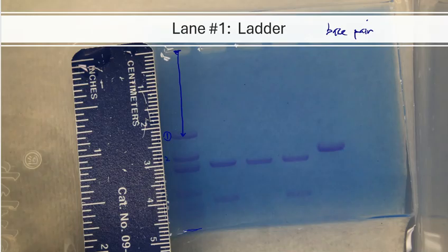Then we see band number 2 and band number 3, band number 4. Band number 5 is actually right here. It's very faint, but it's there. Band number 6 is right here. Again, very faint, but it's there. And band number 7 is actually down here at the very bottom. So once more, my camera did not show that, but in person I saw that a little bit better.